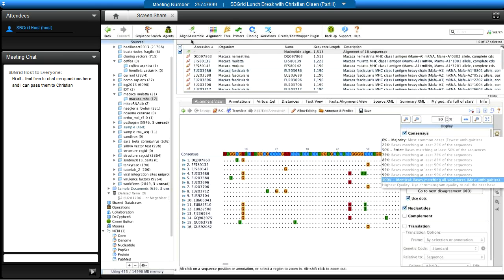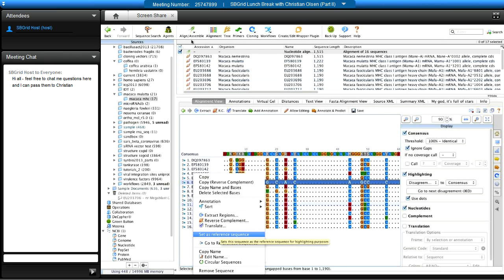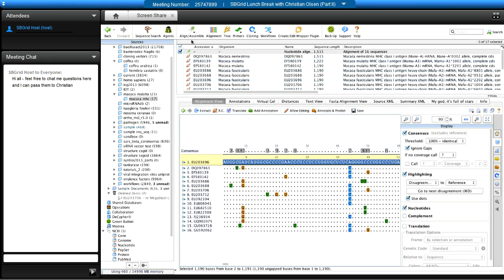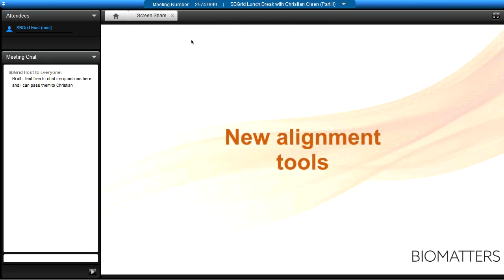You can also control how consensus identity is calculated — here at 100% but adjustable. If the reference sequence is buried in the alignment, you can right-click and select 'Set as Reference,' and all other sequences will be compared to it, highlighted in yellow. You can drag and drop it to the top. Multiple sequence alignment in Geneious is very straightforward.